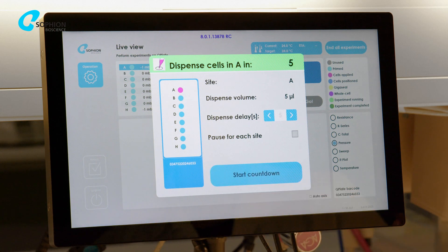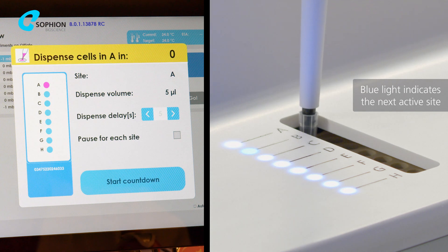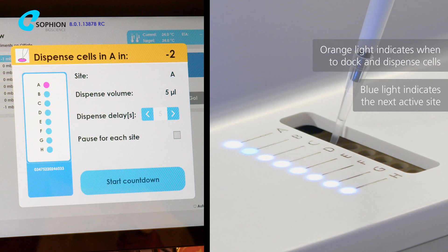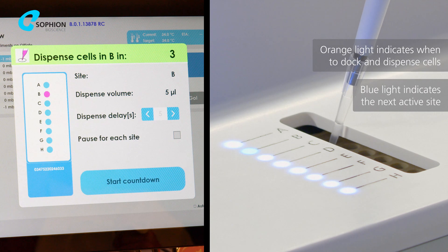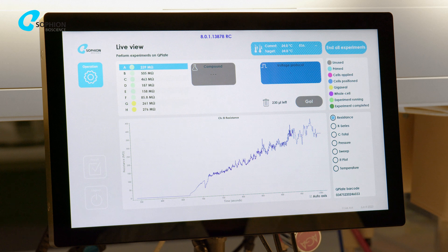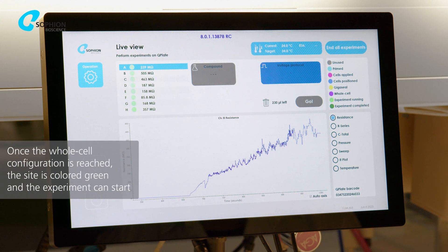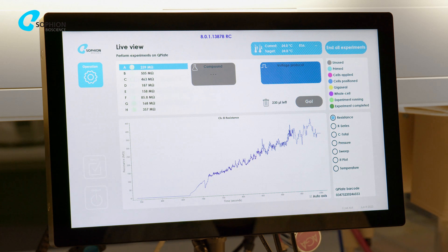Press the Start Countdown button. The light and sound guidance indicate when to dock the pipette and dispense cells. Add the cells site by site as directed by the countdown. Once the Live View panel appears, Qpatch Compact will position a single cell at each of the recording sites, apply pressure to reach gig-ohm seal and whole-cell configuration. The states are colour-coded to easily track the progress of each recording site. The site appears green when the experiment is ready to start.